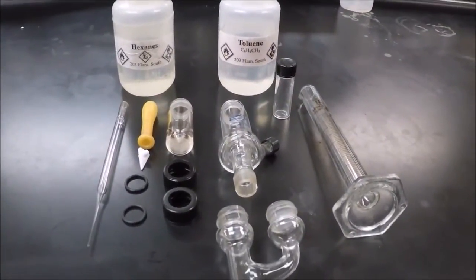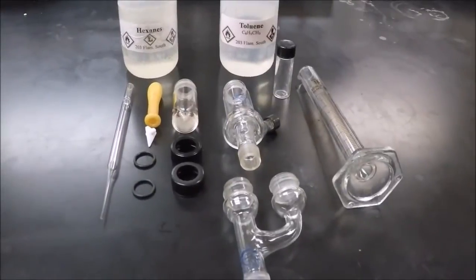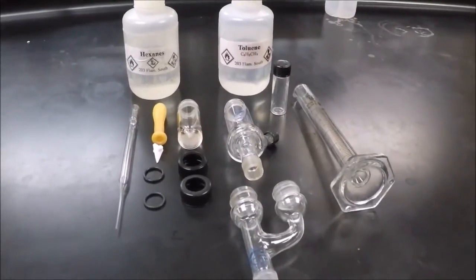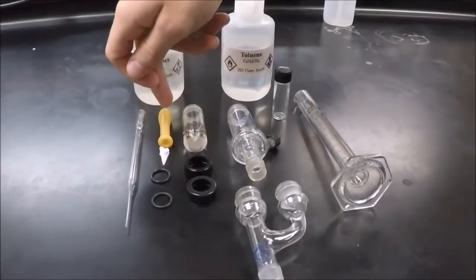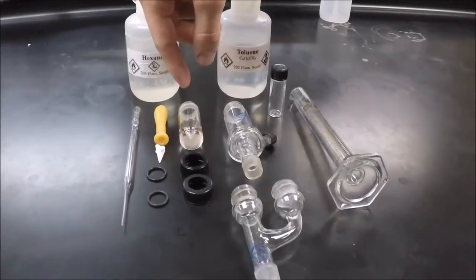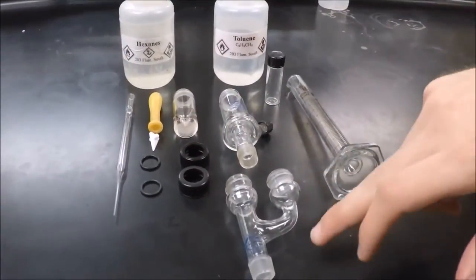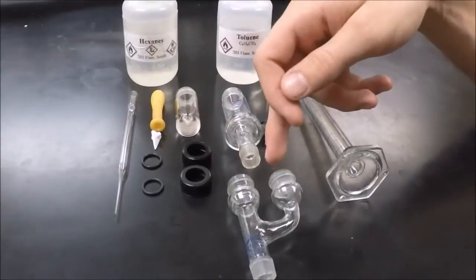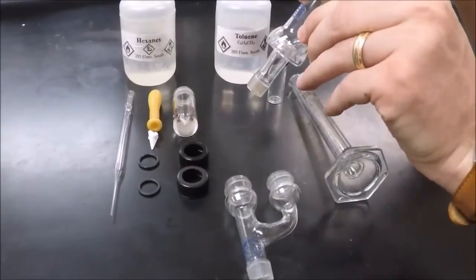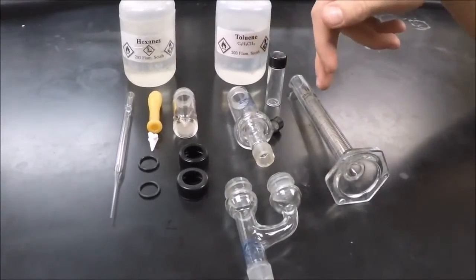We're going to be doing a simple distillation today. Here is all of the glassware and materials you're going to need for this lab. We have the hexanes and the toluene, a pasture pipette with a bulb, and a spin vane which will go inside your conical vial. These are O-rings and screw caps that will connect your glassware. This is a Clayson head and a Hickman still — make sure it has the little cap on there. This small vial is for collecting, and this is a graduated cylinder.